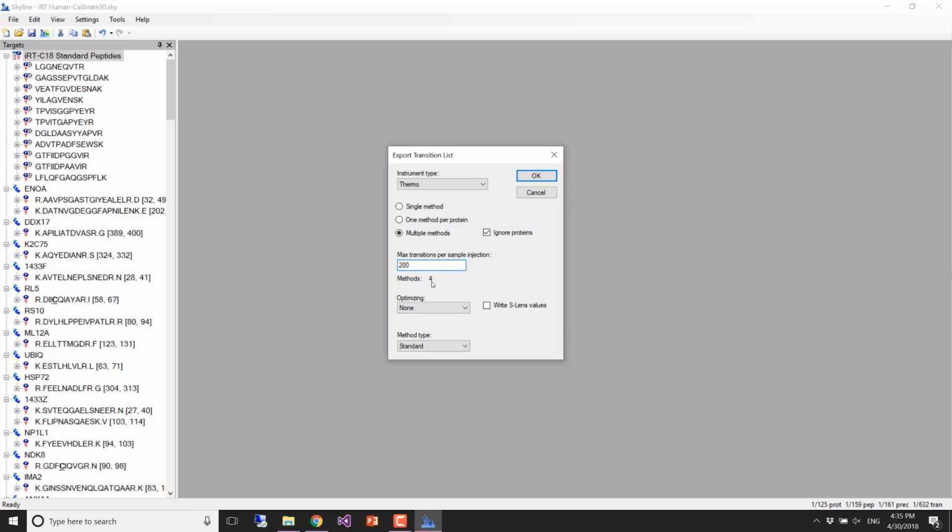But okay, so we don't need to be quantitative. All we need is just one spike that tells us where the thing is, right? So we're going to push it even a little bit higher than here. That might be if you actually wanted to do a real quantitative assay. So let's say, what if we pushed it up to 400? Well, then we have two methods.